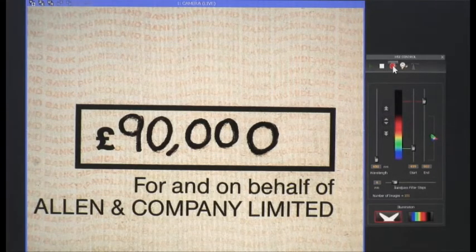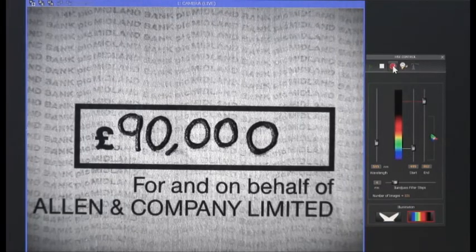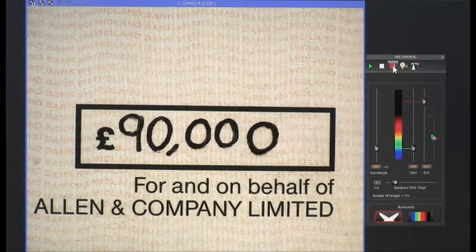Finally, click the Record button. With this number of images, the recording takes just over a minute. At the end of the recording process, the floodlights are turned back on. You'll notice that the Play button is now enabled.